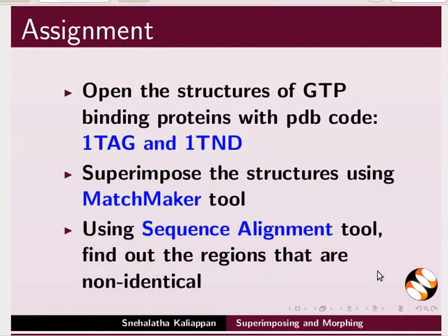Using sequence alignment tool, find out the regions that are non-identical.